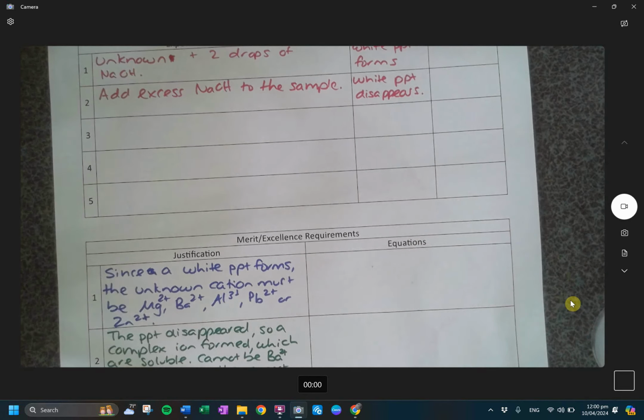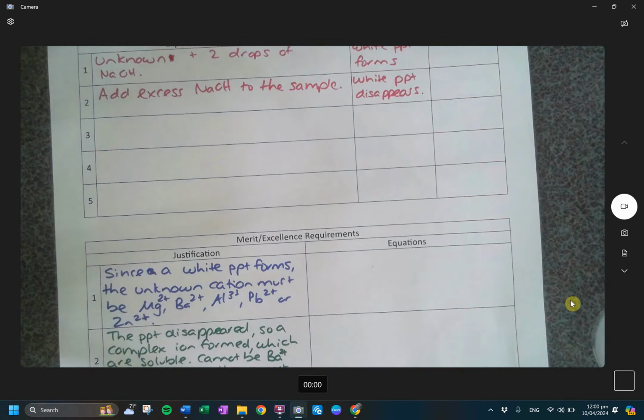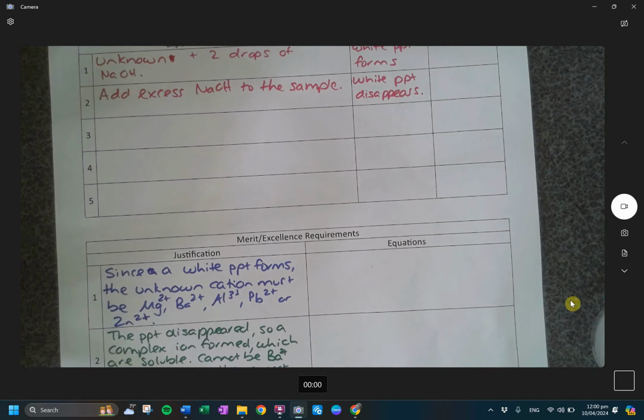So when you had lead, now I gotta find my lead. So here's lead. That was not a clean beaker. Rinse that out again. All right. So this is why I want you guys to ask me for known ions if you're having a hard time distinguishing between the three of them, because the white ions, or I should say the lead, the aluminium, and the zinc, are very similar. The aluminium one, unfortunately, doesn't really produce anything that's really obvious. It's more like a jelly-like texture, which is hard to see.